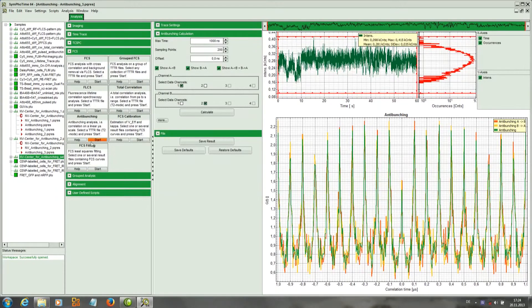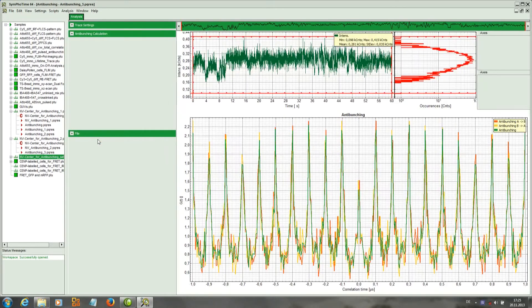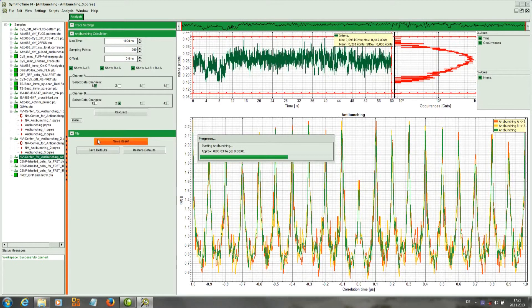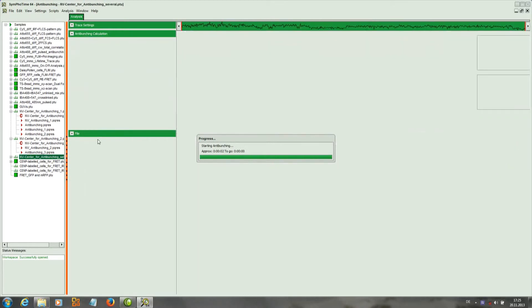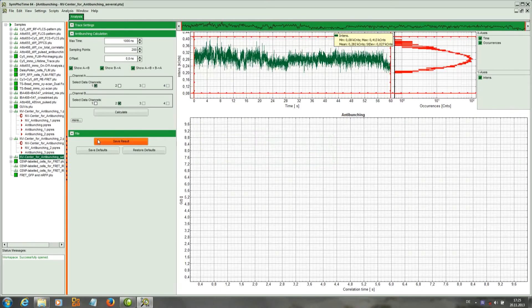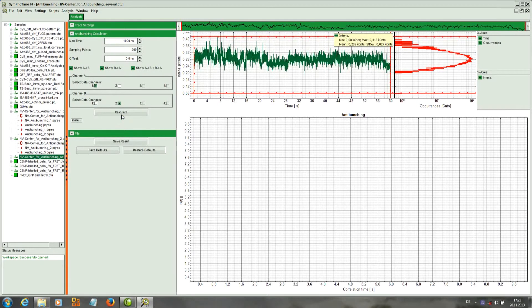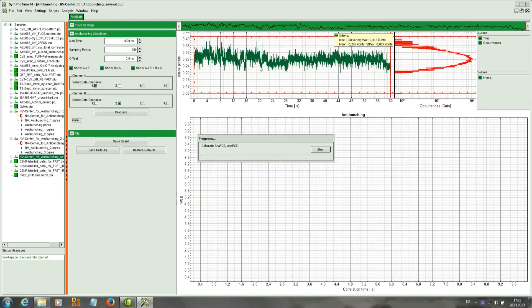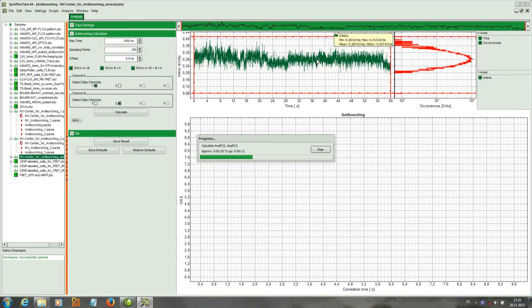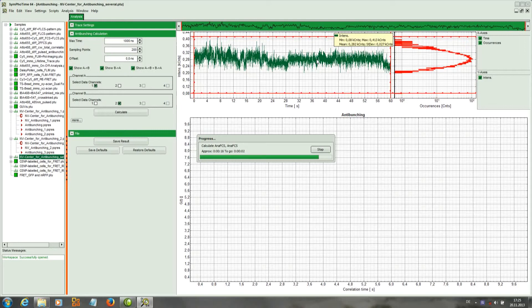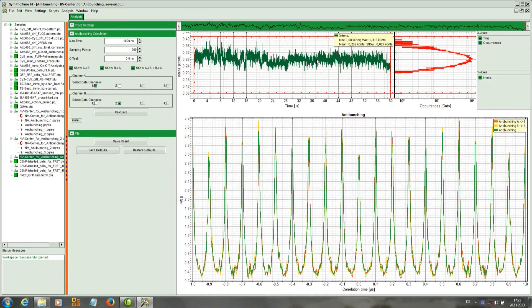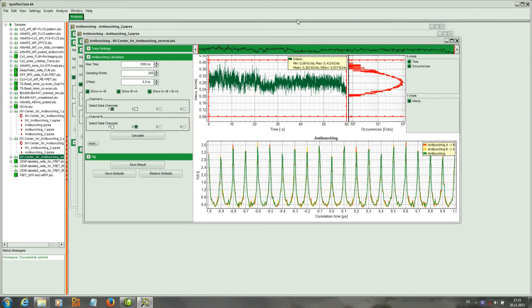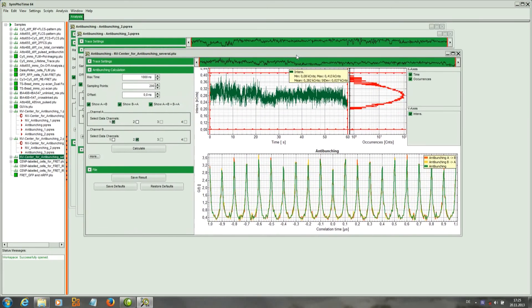And again start the anti-bunching script. And the result in this case is the anti-bunching curve which this time has a central peak that is almost as high as the other one. So that indicates several emitters.